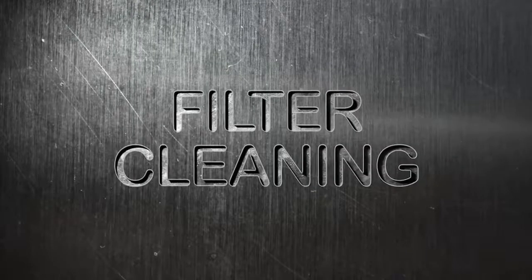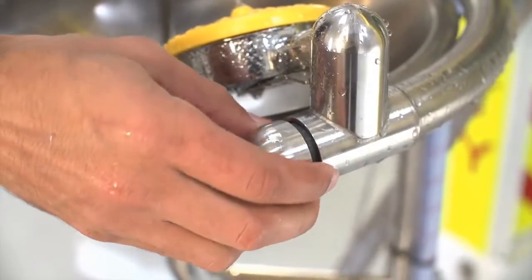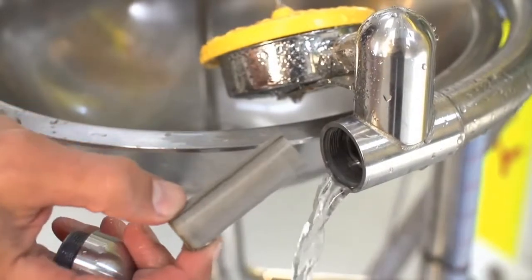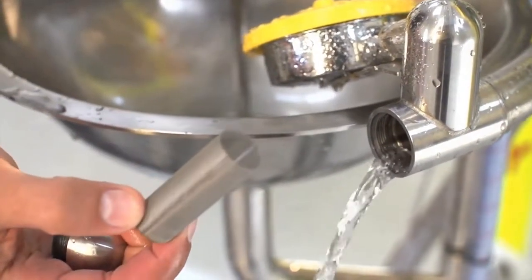Ease of cleaning filters. Ashley's filtration system is easy to access and clean, keeping maintenance fees low. A simple 10mm Allen key is all that's needed to access both filters.